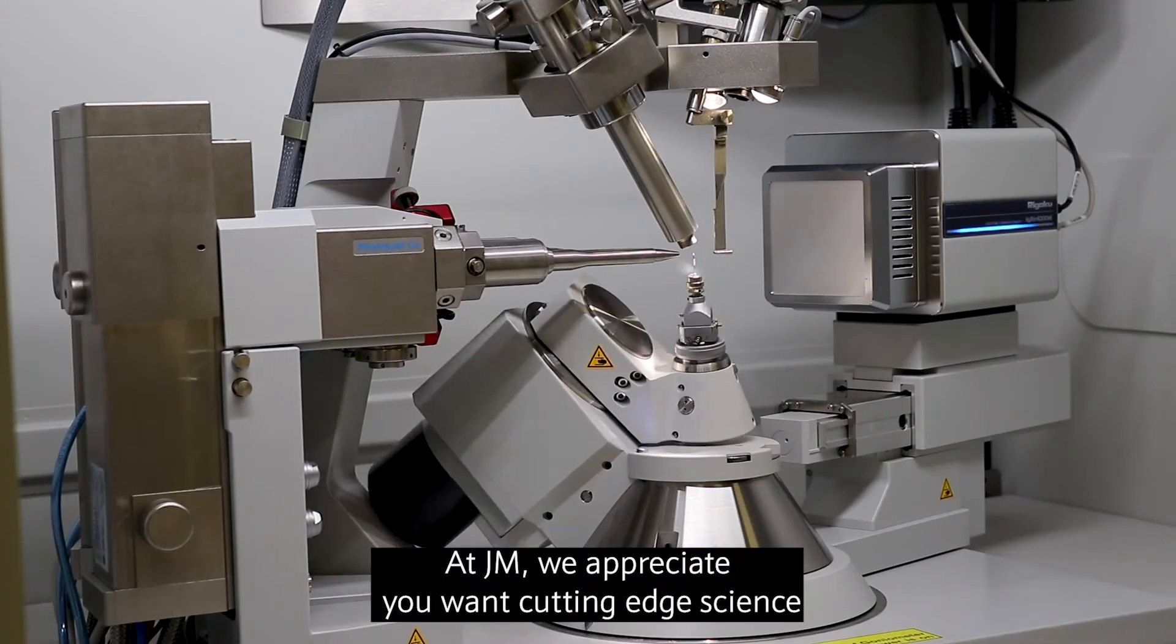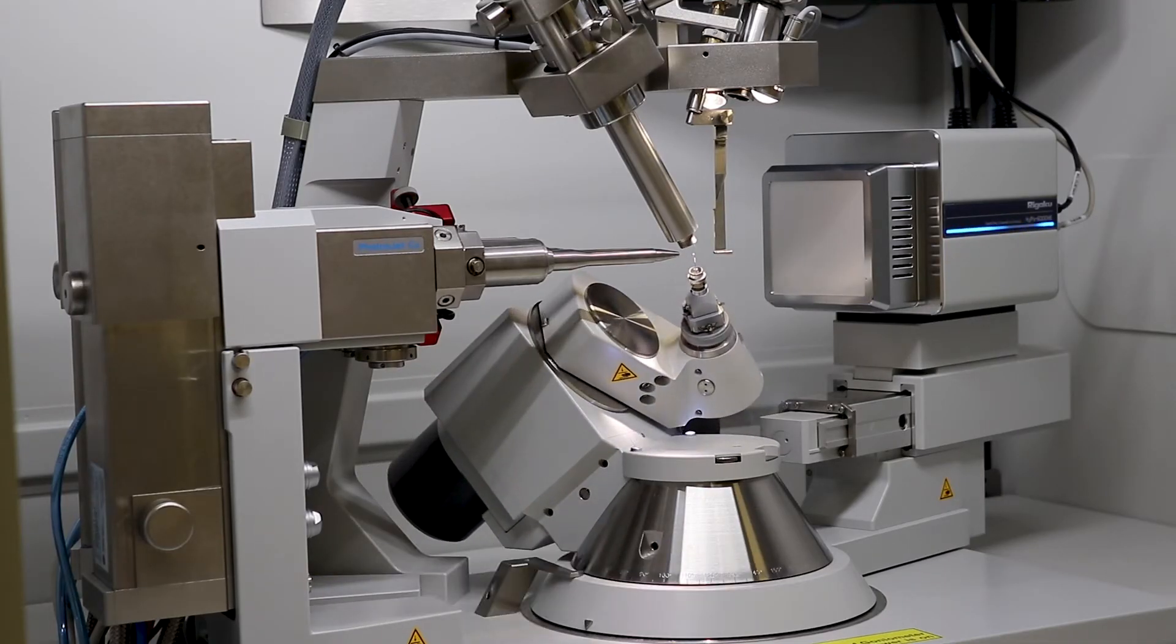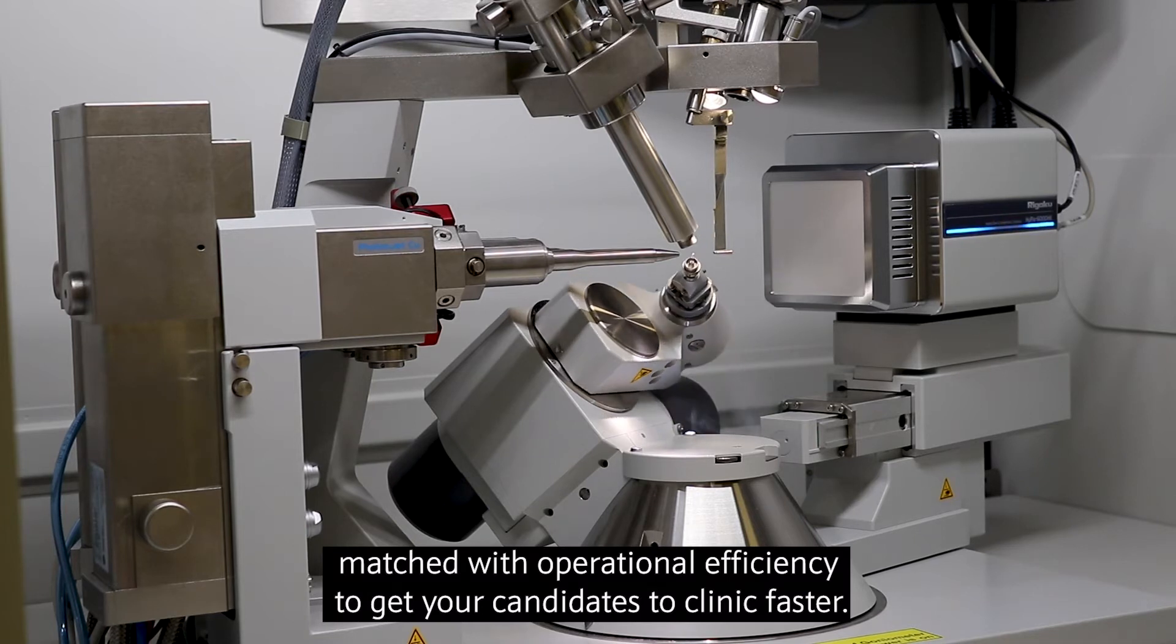At JM we appreciate you want cutting-edge science matched by operational efficiency to get your candidates to clinic faster.